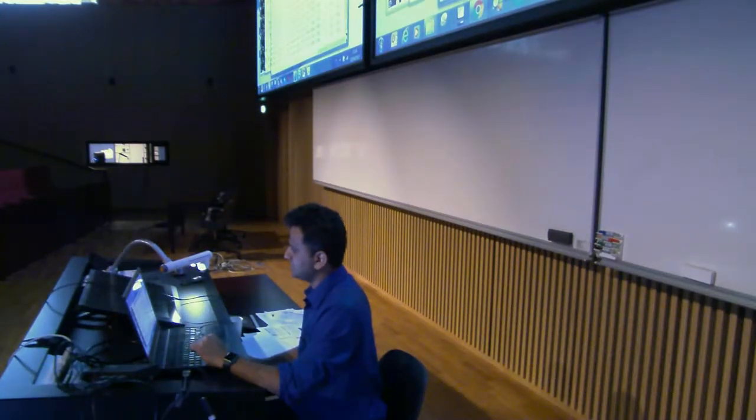And this is all the individual information, the features about every nucleus. This is the area, this is the mean intensity. Now you see what happens is the mean intensity is 255 because we have worked on the masked image. Now, how to get the raw data information out of this one?